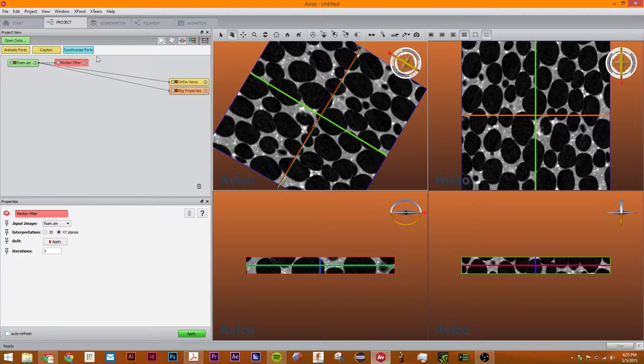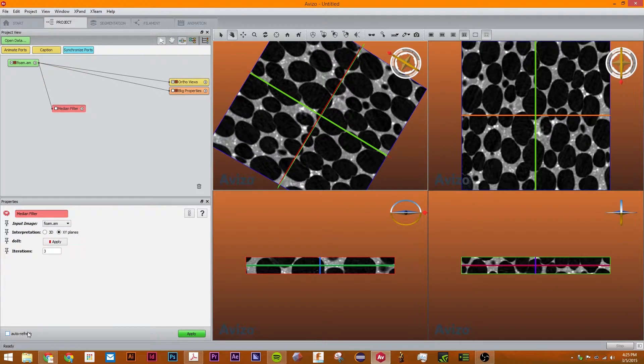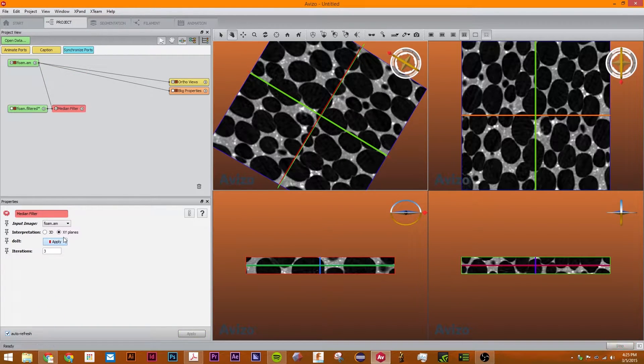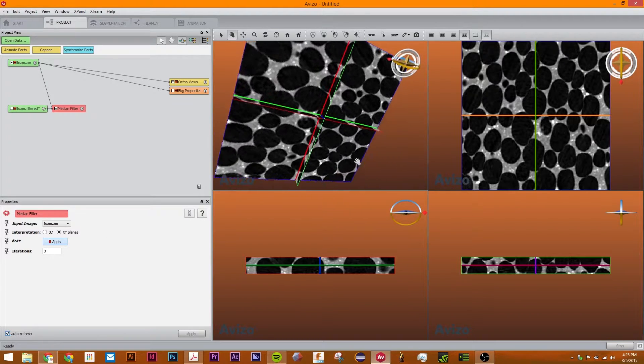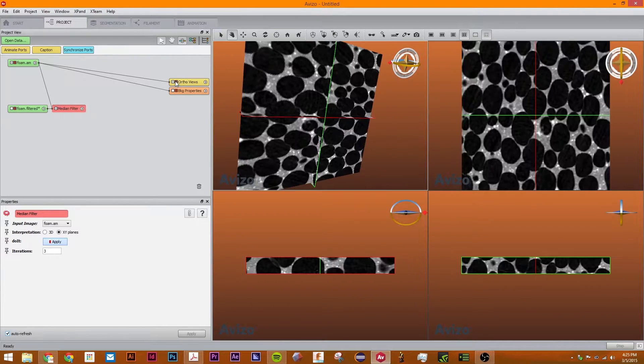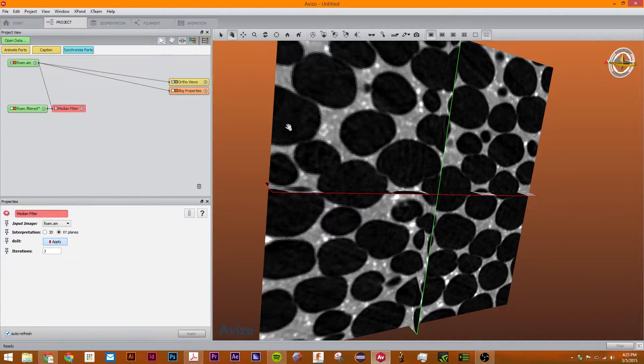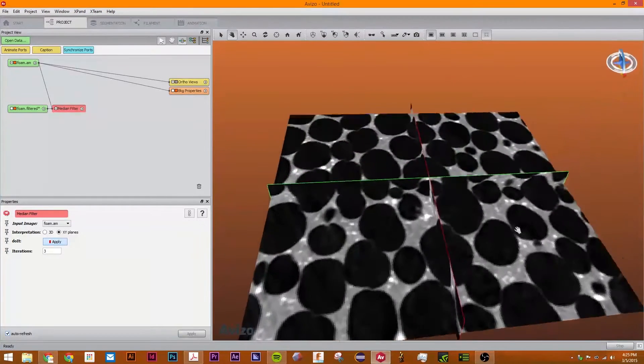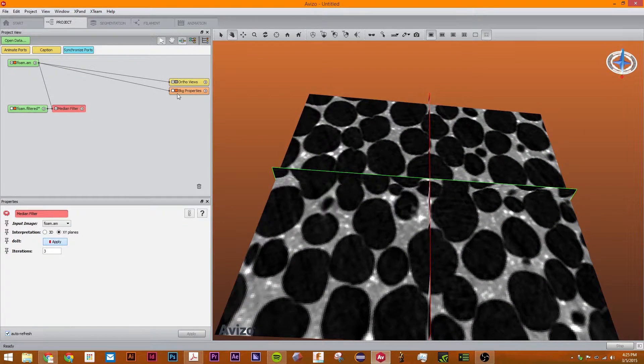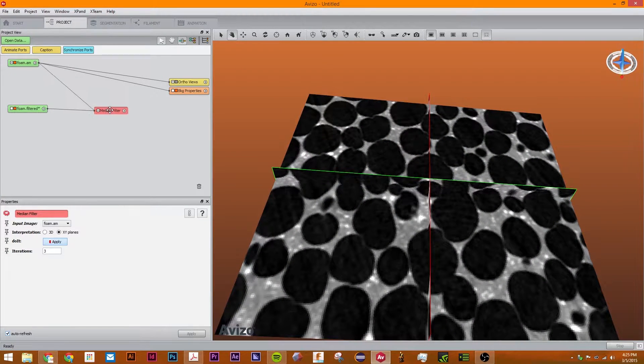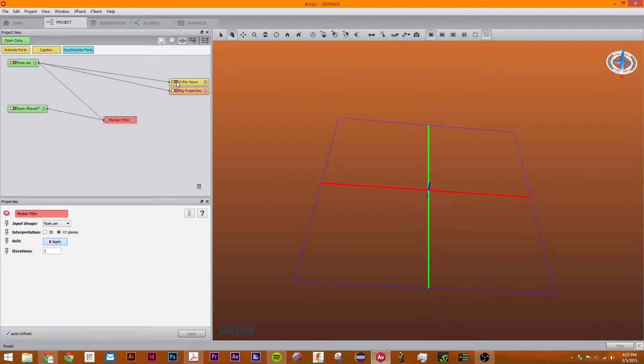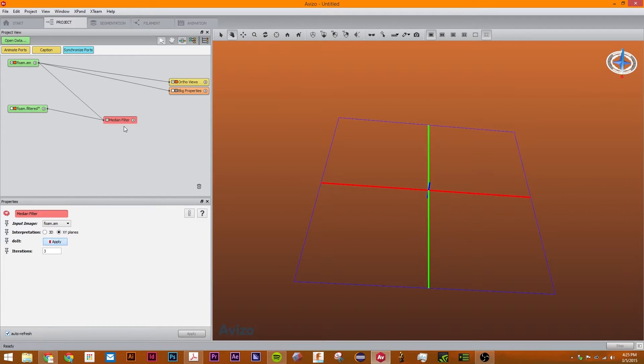We just click on the median filter and I'm going to click auto refresh so I can show you what's happening. Make sure to disable these ortho views and reattach them to this one.